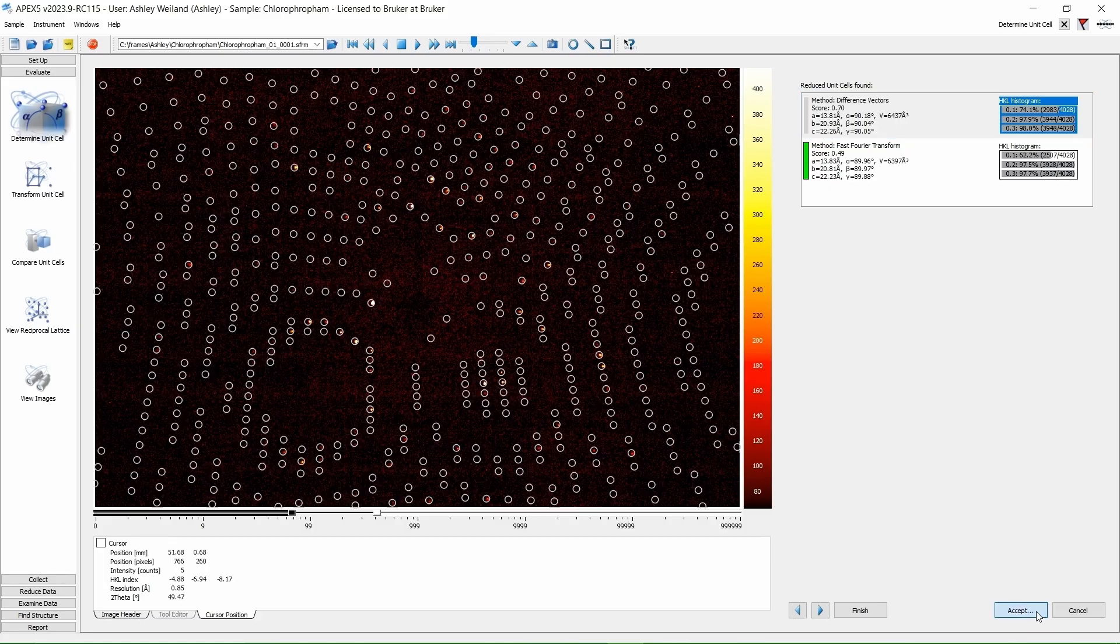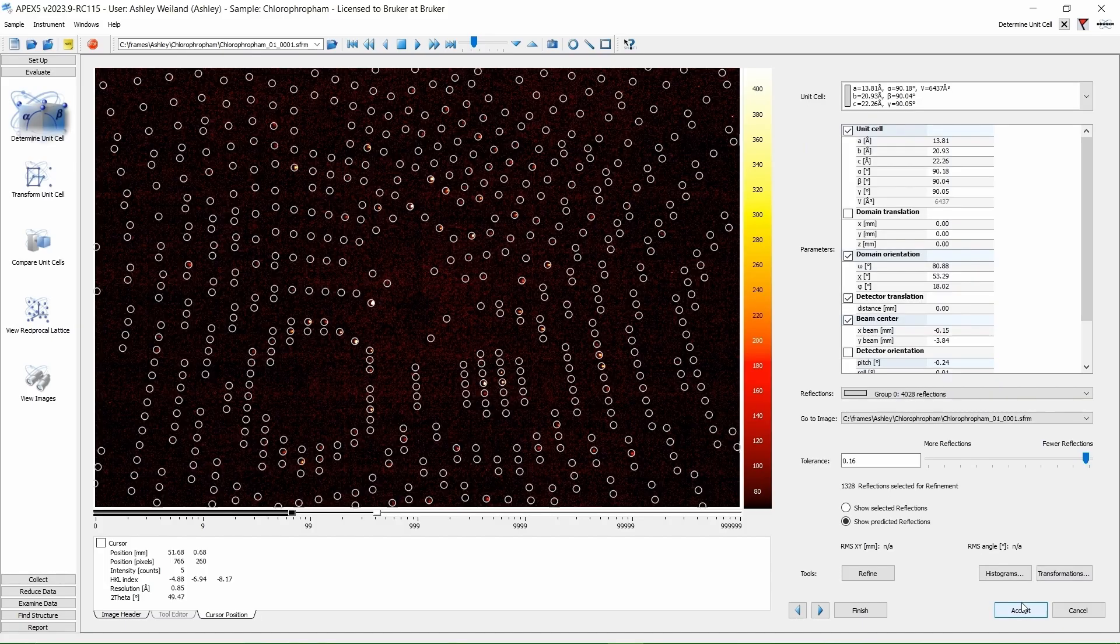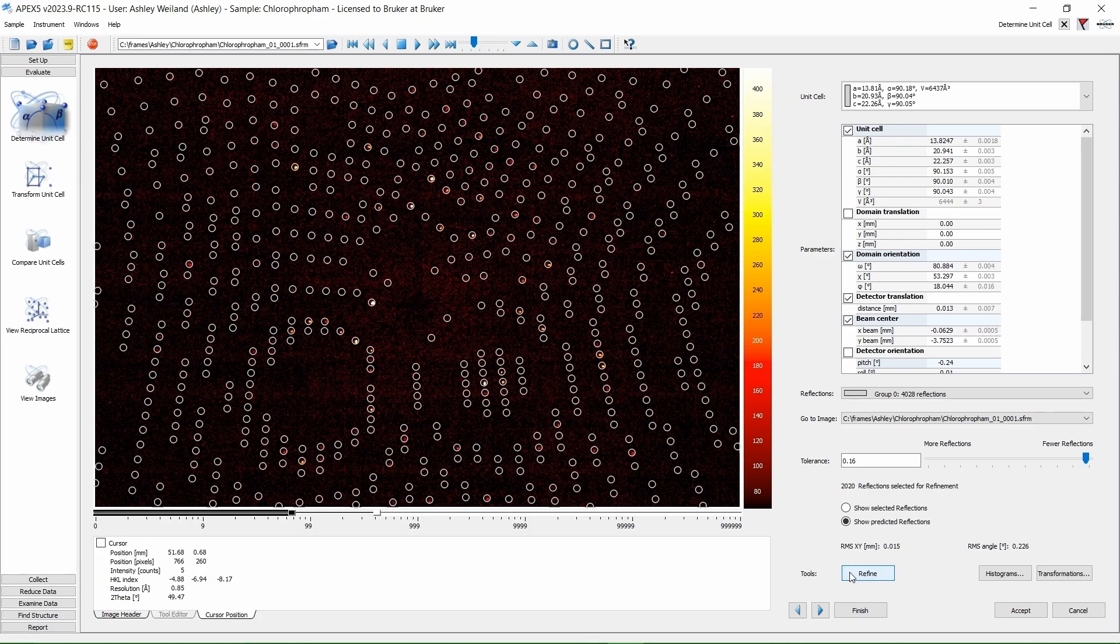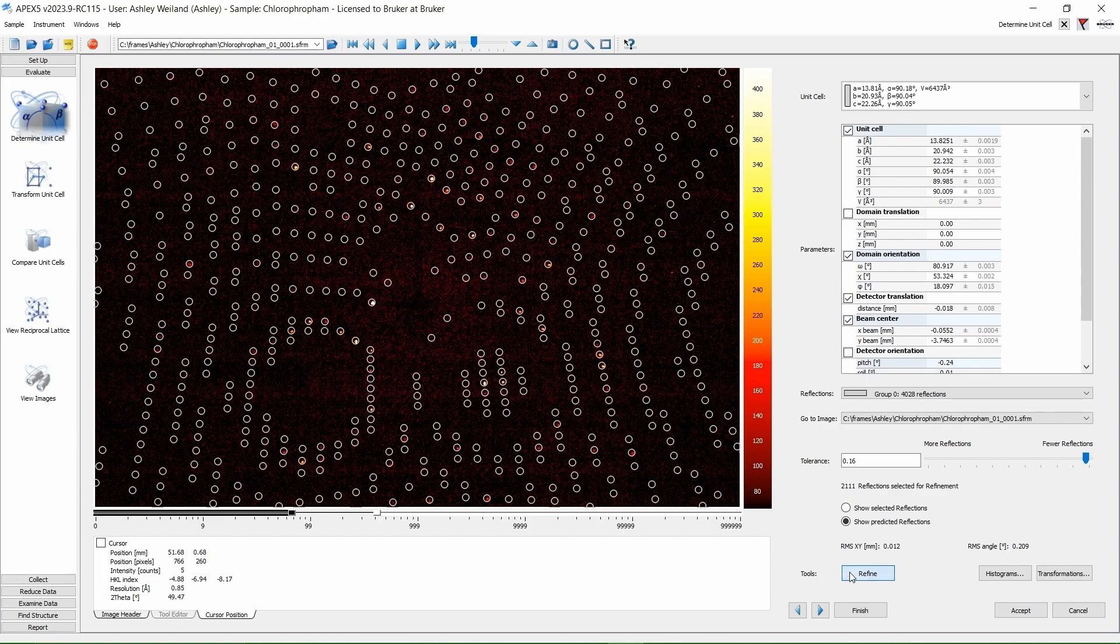Now that we have a rough idea of how these reflections are related, we are going to refine them a bit. Click Refine a couple times. Then click Accept.